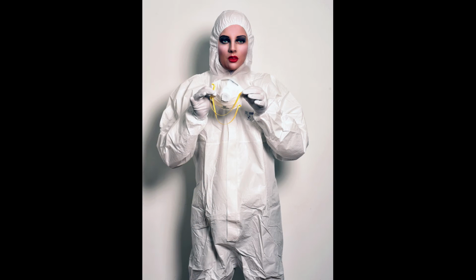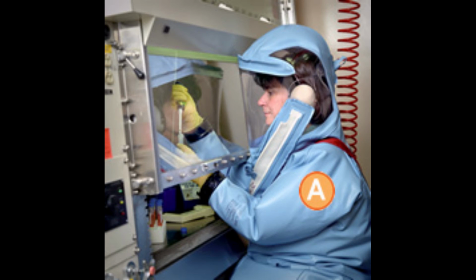Level 4 continues to build upon all the requirements we've already mentioned, and being the highest level of safety, you would expect that they take it up several levels further. There aren't very many Level 4 laboratories across the globe. The reasons for this are relatively simple. They're incredibly expensive to build. There's not a lot of demand for what they do, and what they do is incredibly dangerous.